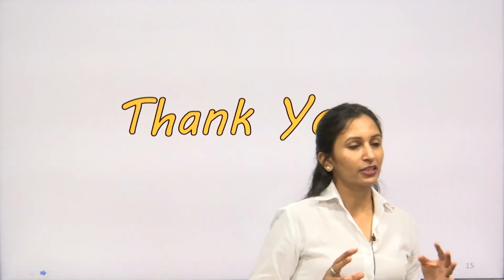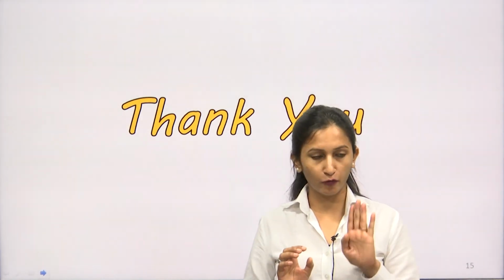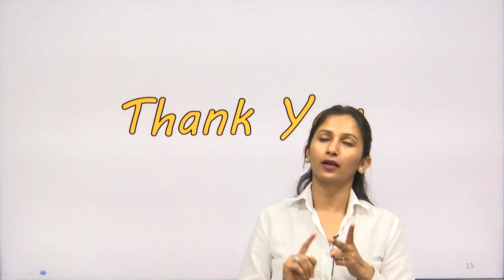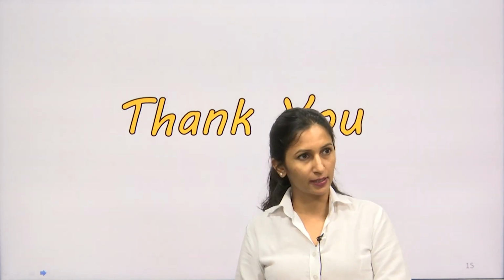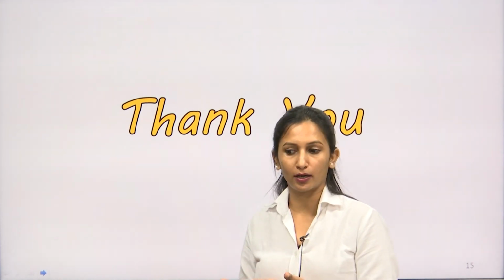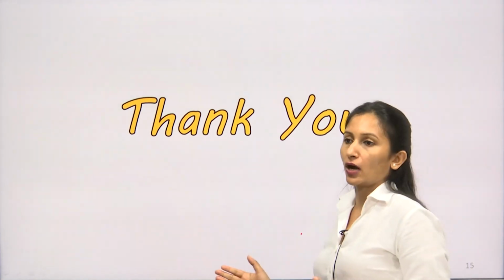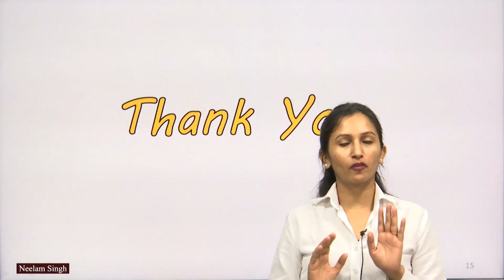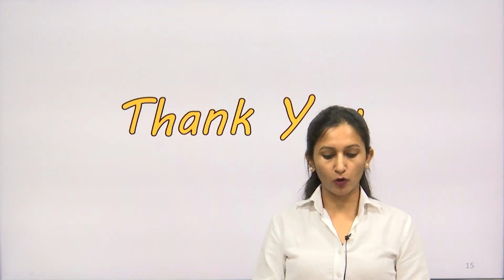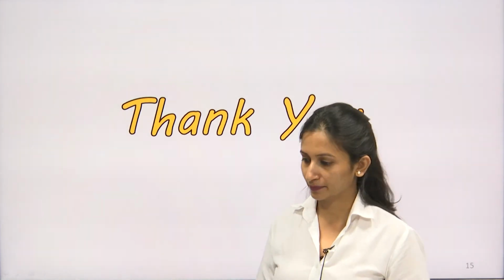For the determination of particle size, we have to study four methods, of which two, sieving and microscopy, we have already studied. In the next lecture we will study the next two methods, the sedimentation method and the Coulter counter method. So for the determination of powder particle size there are 4 methods: sieving, optical microscopy, Coulter counter and sedimentation method. Thank you.